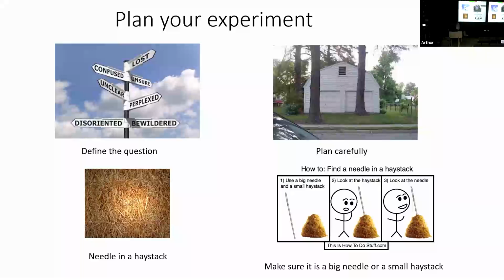Think about the ultimate end result that you're going to get and understand that biology is a diverse field. So cells within the same culture plate are going to look different from each other. They're going to be slightly different. So you've got to plan for those controls and think about how, if it's a little bit different, how am I going to know this is the experimental versus the healthy normal control?